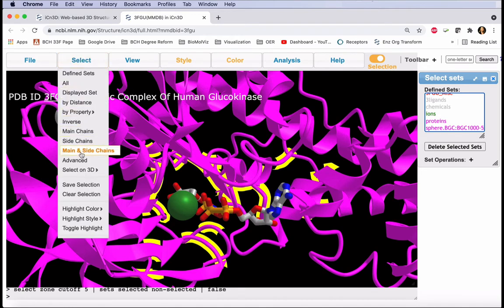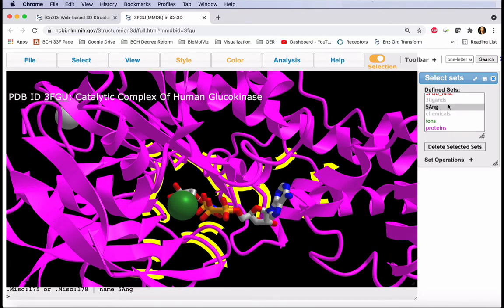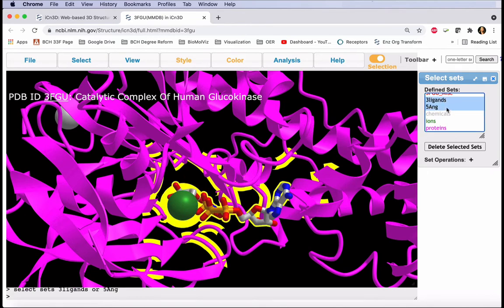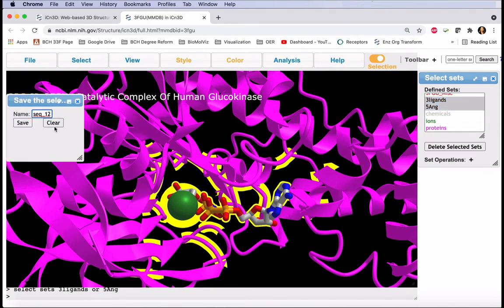Let's save this selection using the Select menu, and I'll call this Five Ang. To combine these two selections, I can Command or Control-Click on both of these, and save this new combined selection, which we'll call 5A Full.